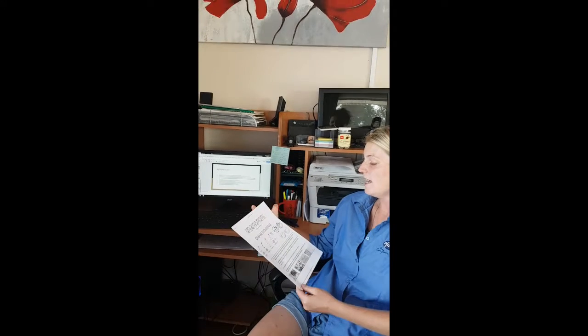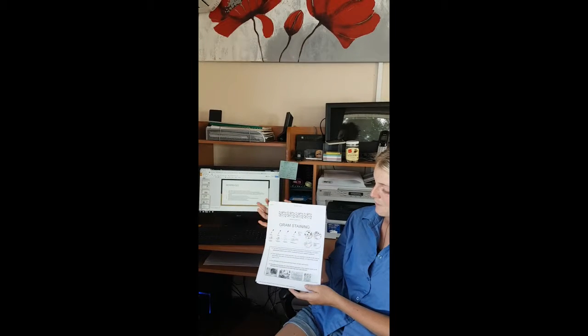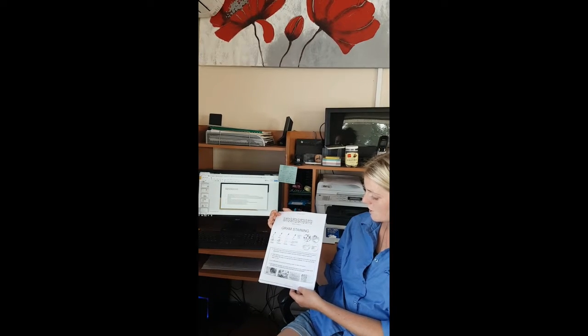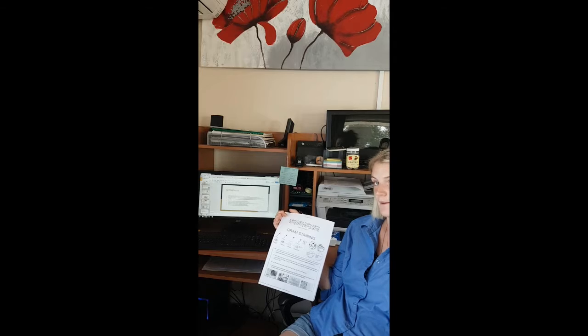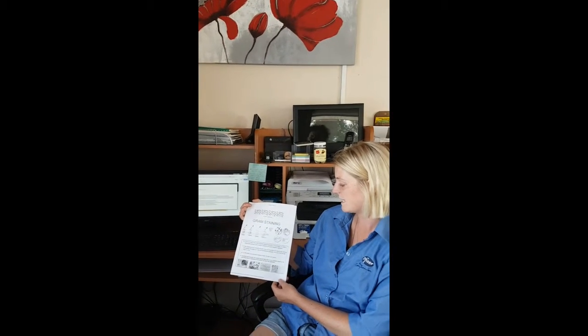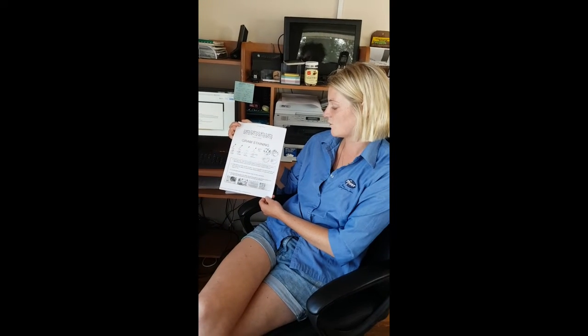Yep, awesome. And then we have here, I've done my handout for the clinic. So we've done the gram staining. I've just added a couple of pictures in there, and I've just put a few bullet points about gram staining. So again, the stain is the most important staining procedure in microbiology. It's used to differentiate between gram-positive and gram-negative. Also, gram staining of snot, wounds, skin, so this is important to be able to see what we are treating. This helps us to give the best effective antibiotic, or to see if they actually need it or not.